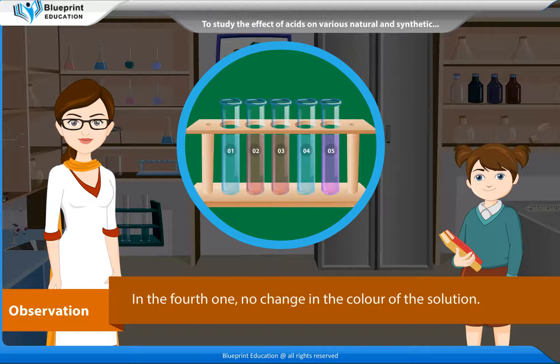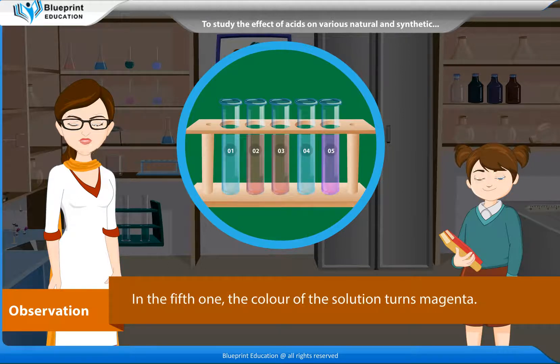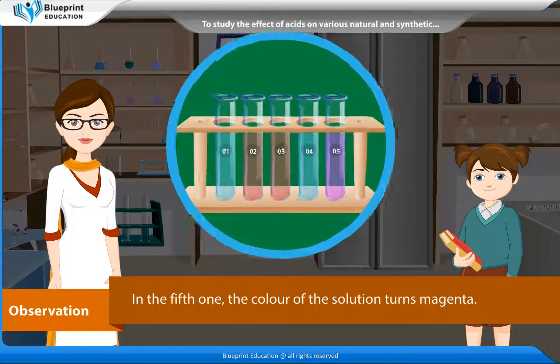In the fourth one, there is no change in the color of the solution. In the fifth one, the color of the solution turns magenta.